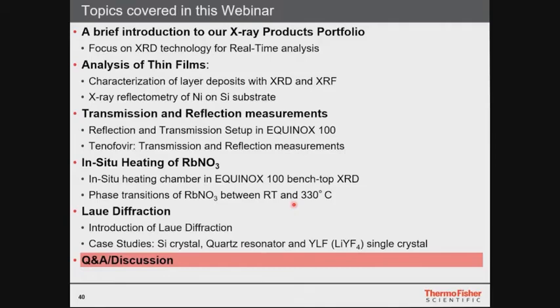There is always a limit of detection, and this is very specific and different for each sample. So in principle, the best thing is to just do test measurements and see if we can satisfy the need with our instruments. But in principle, something like this is possible.